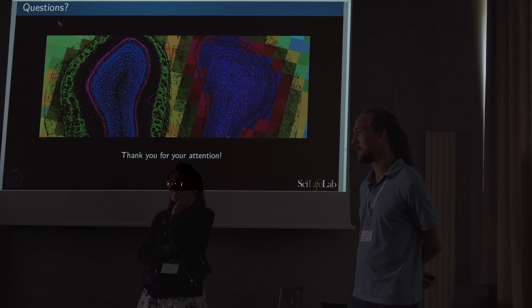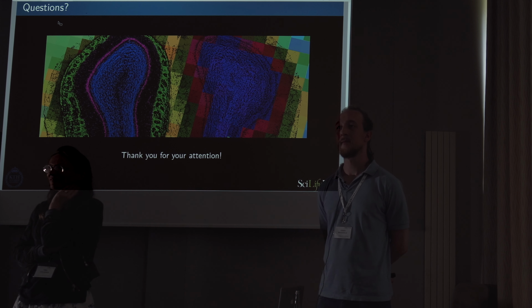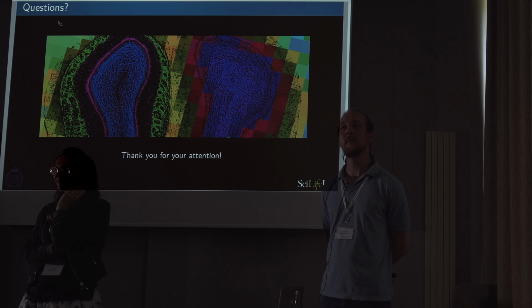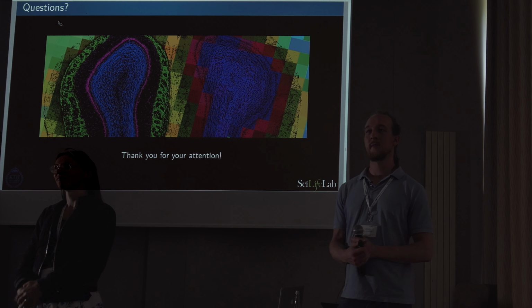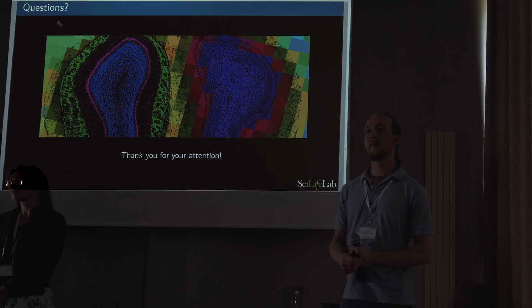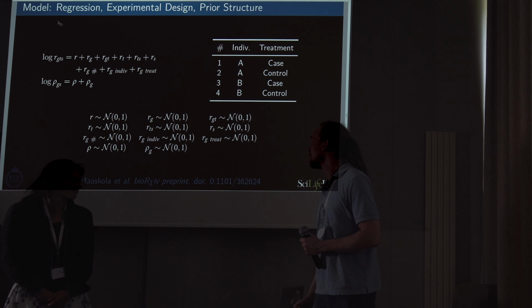Are there any questions? Yes. Great topic. Very early on, you said that you can correct the batch effect. For example, you're including preparation date and whatever other processing batch effect into your negative binomial regression. Is that essentially how you fixed it?